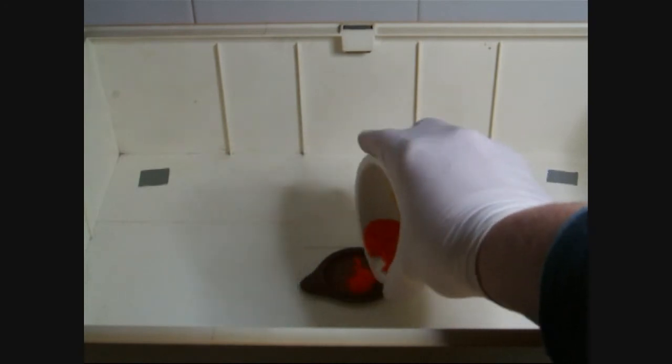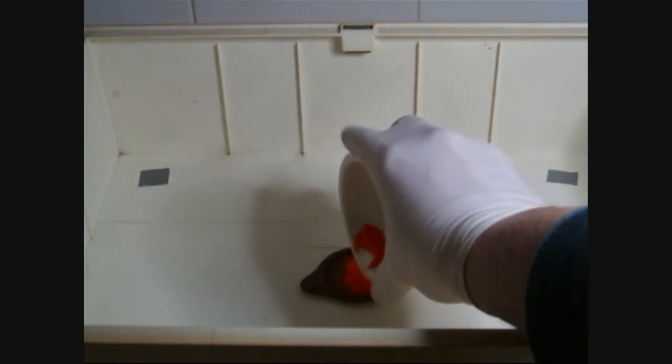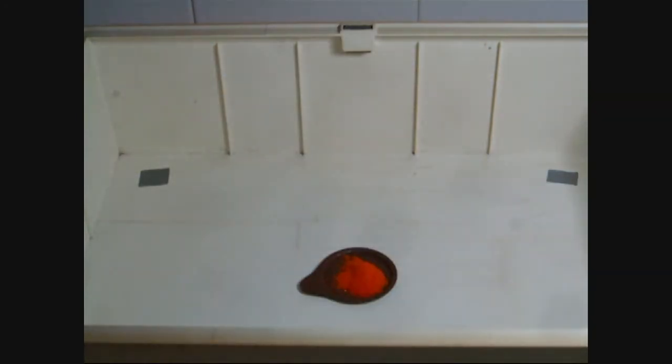Hello and welcome to another chemistry video. Today I want to show you the decomposition of ammonium dichromate, also well known as the dichromate volcano. For this purpose, some fine powdered ammonium dichromate is placed onto a hardly combustible surface — I use the lid of a crucible.